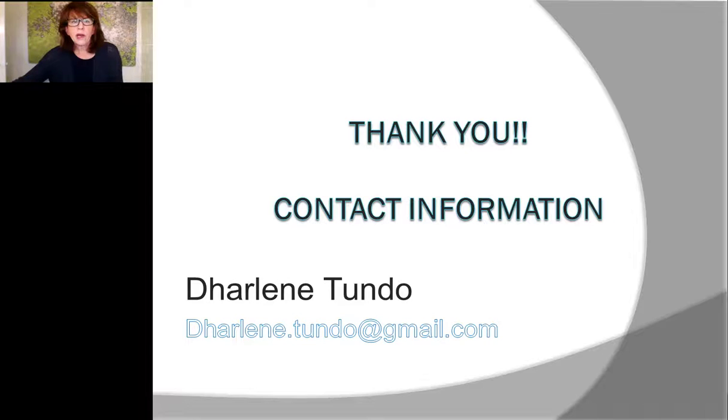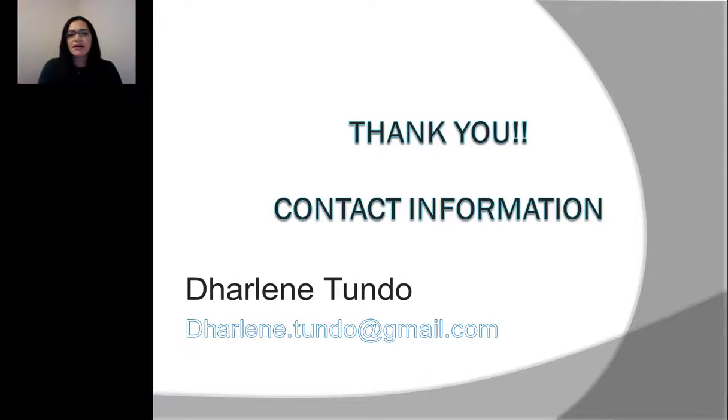Your next question is, what controls were used during this experiment? Thank you for your question. For the controls, we use unstained samples, and unstained samples for each different probiotic cell type, and for each different type of sample, either raw material or chewable form, we use non-stain. And we also did fixation of samples using formaldehyde to confirm that we were seeing or detecting the bacterial populations that we were looking for.